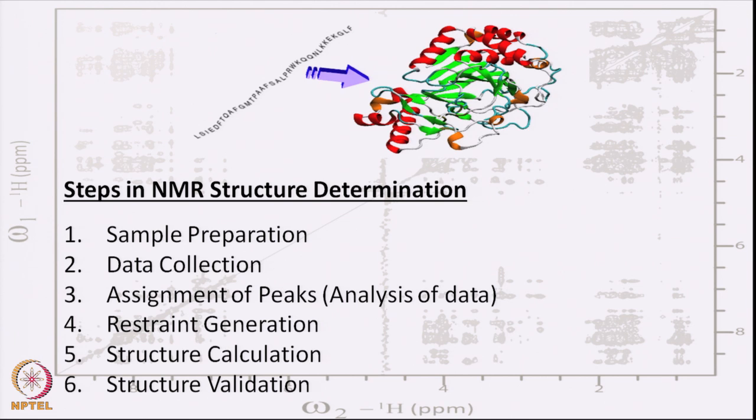We discussed some primary steps in NMR structure determination. First is sample preparation. For a peptide we need to synthesize it or bacterially express it and purify it. The pure peptide has to be dissolved in the solvent in which we want to solve the structure, and 10% D2O, or deuterated solvent, is added for locking the spectrometer. The sample has to be transparent, with no aggregated particles. For purity we can use orthogonal techniques like mass spectroscopy, MALDI, or SDS gel electrophoresis to see that the band is single, and that tells about the purity of the sample.